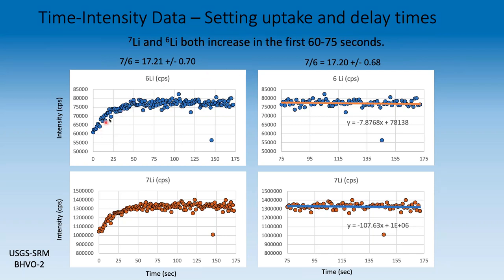So if we look at that uptake here, we have this one, where this was one of our experiments where we started the machine with really no delay time whatsoever. We put it in, we let the sample, we hit go. And we started to get counts as soon as the sample came up. And this is when our sample started to give us counts. And we could see that it was roughly almost 75 seconds worth of uptake.